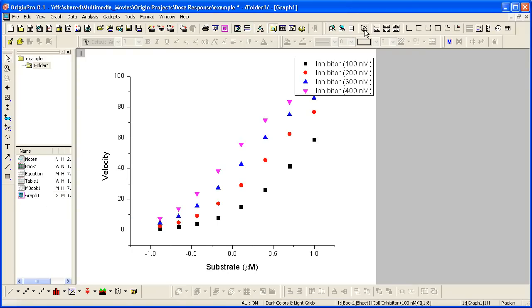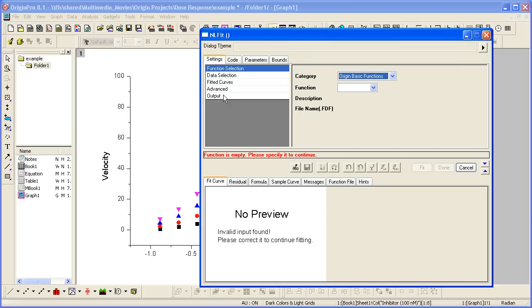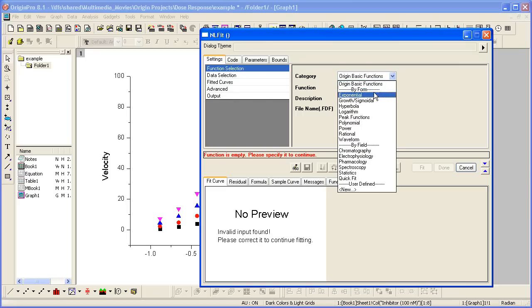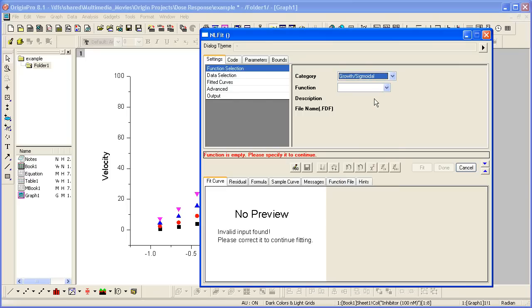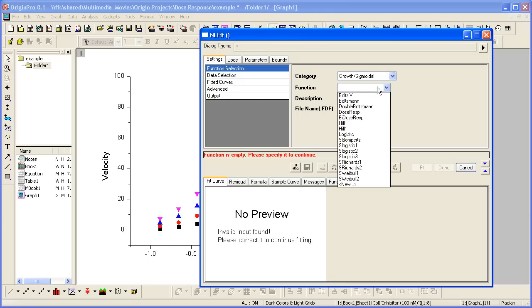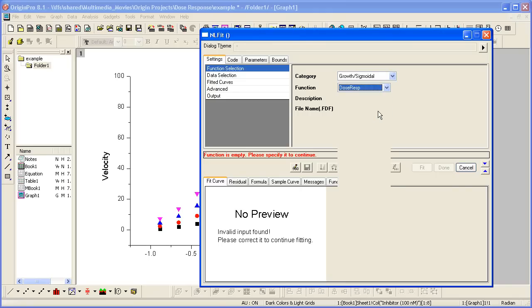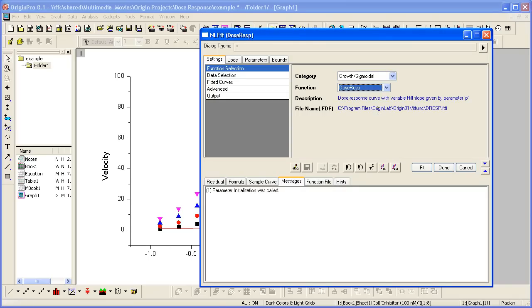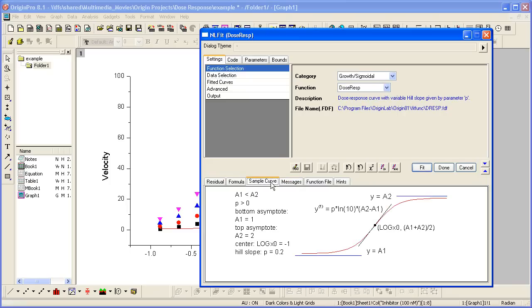And then we can reopen the fitter using the menu or control-y, the keyboard shortcut. Again, we select our category and our function. The dose-response relationship measures the effect, response, caused by varying dose, substrate, where A1 and A2 are the lower and upper asymptote.